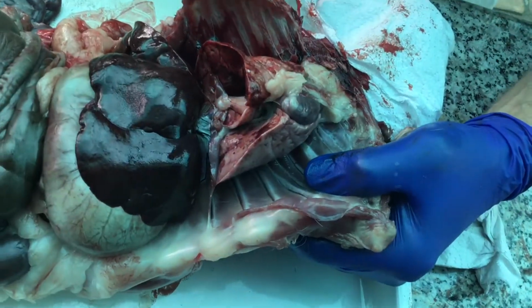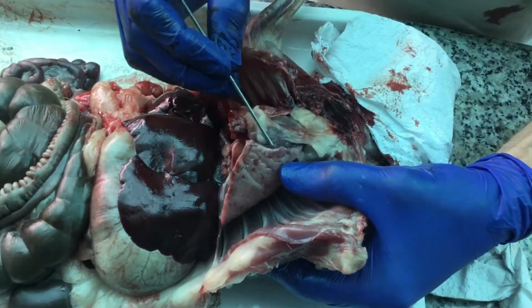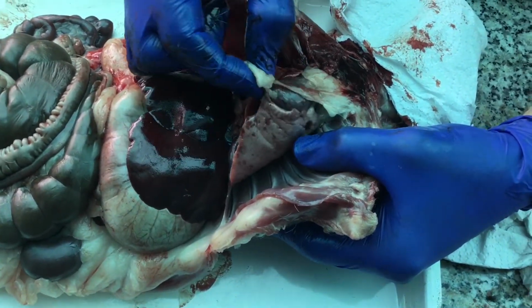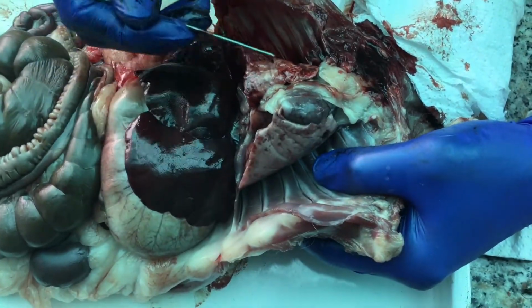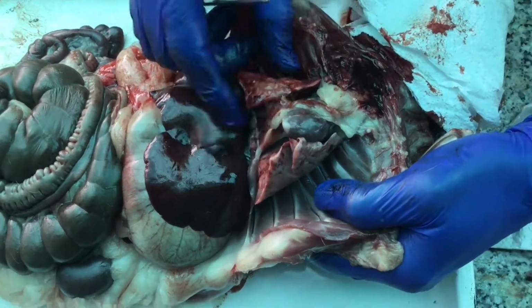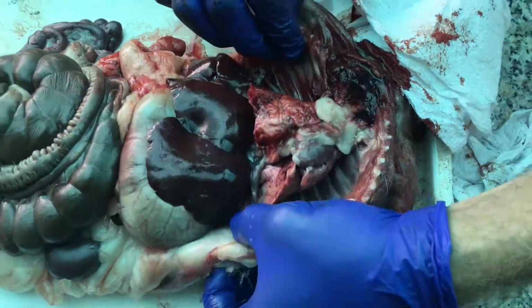Now I can really see the heart in the middle, inside its own special surrounding serous lining called the pericardial sac. It has a lot of fat on it, as you can see, and then the lungs on either side. So now I can see quite clearly that entire organizational plan of the body.